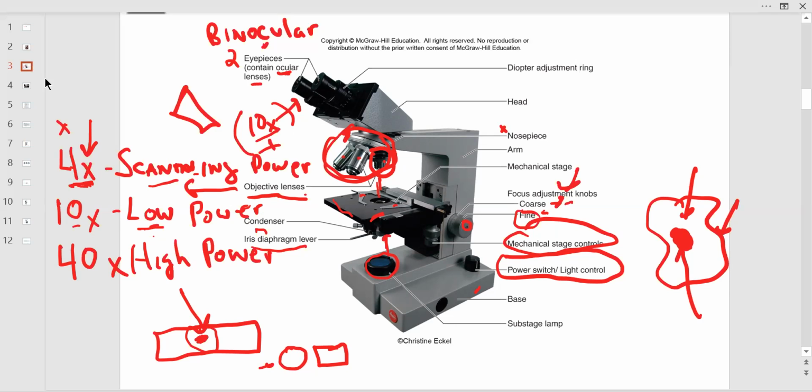I'm going to talk a lot about that next week. But imagine seeing your own cells. It's exciting. Or blood cells. We could have pricked our finger, put blood on this microscope slide, and gone through all these steps and found out the same thing. Right?